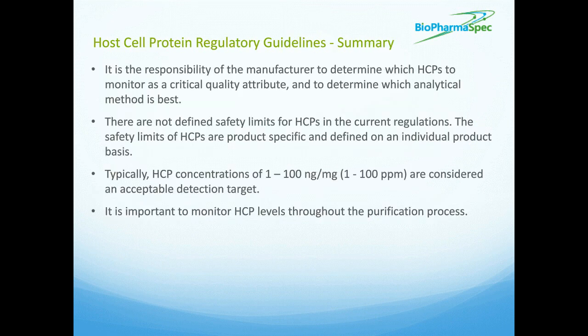So just to summarize, it is the responsibility of the product manufacturer to determine which host cell proteins to monitor as their critical quality attribute, and also to determine which analytical method best suits them. There aren't specific defined safety guidelines in any of the regulations for host cell protein amounts. These safety limits are defined by the regulator and the manufacturer on a product-specific level.